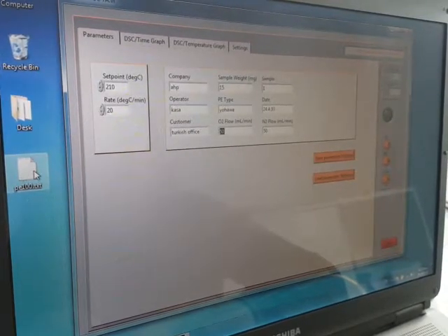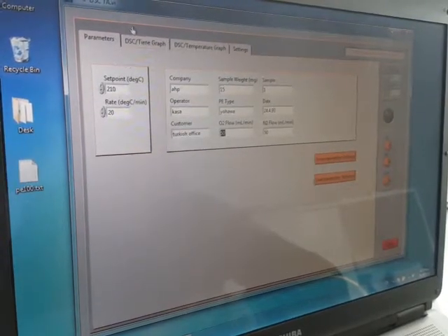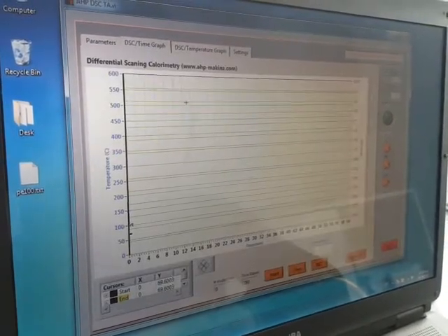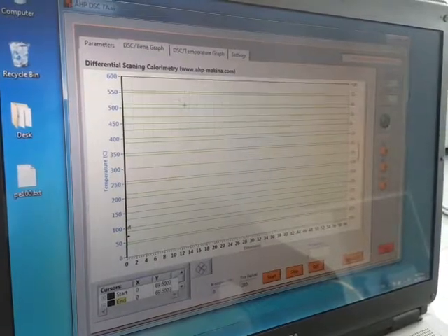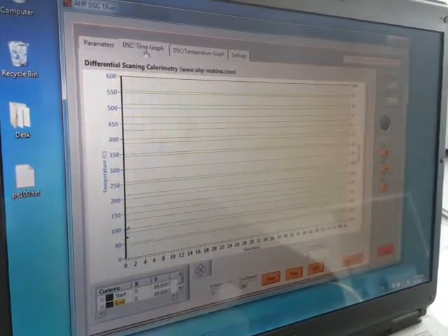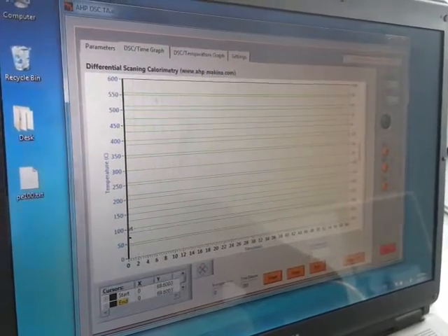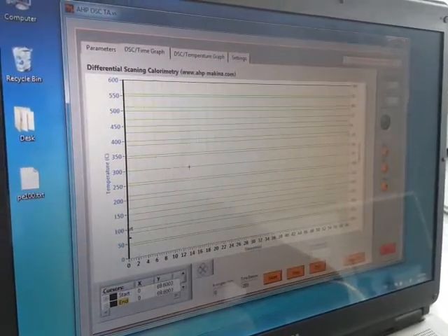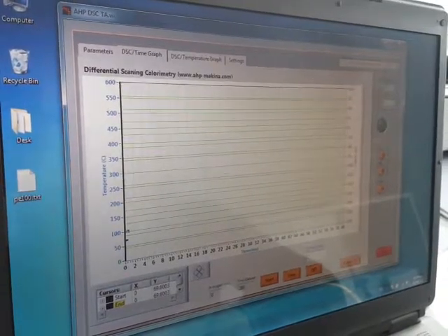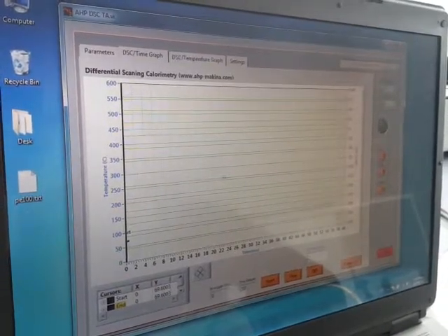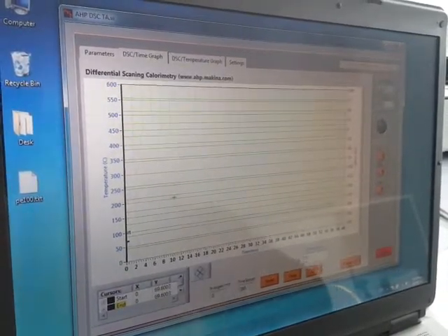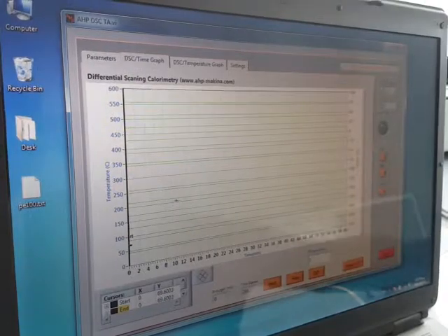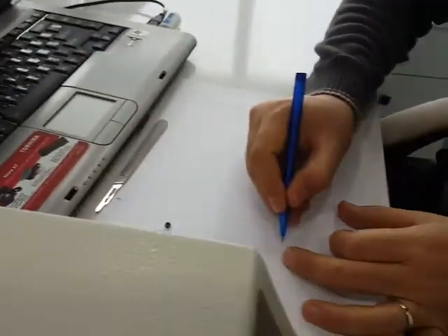In the second page the operator sees the DSC time graph. It is used for measuring the oxidation induction time. Actually in oxidation induction time test we will have a graph something like this.